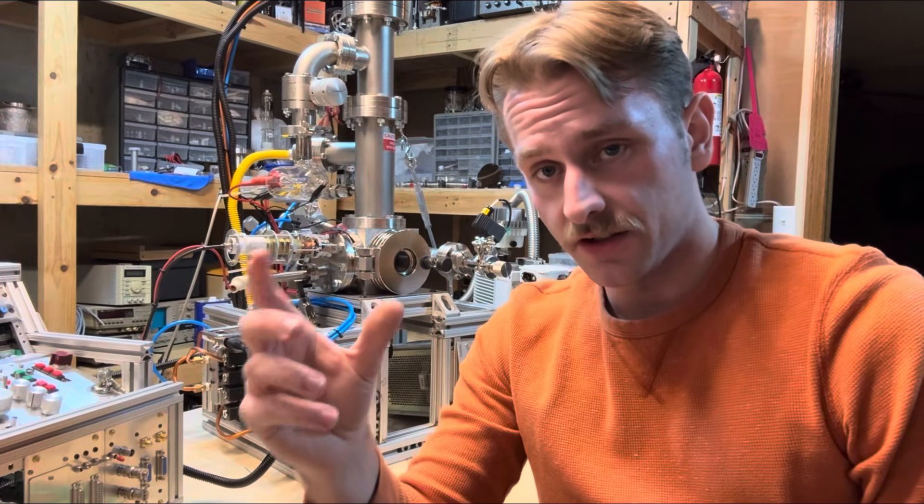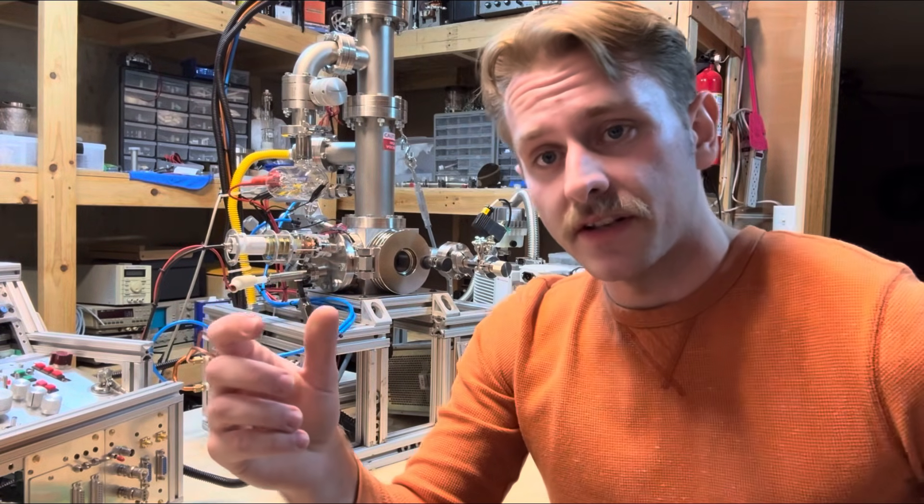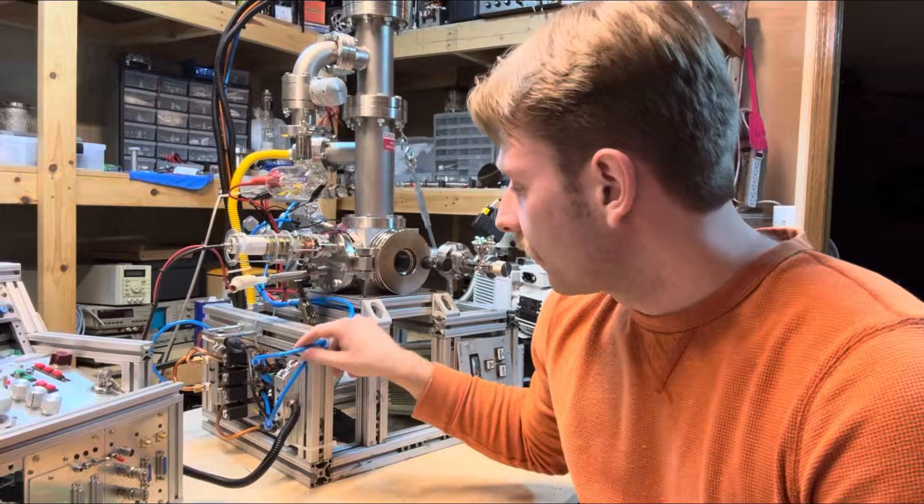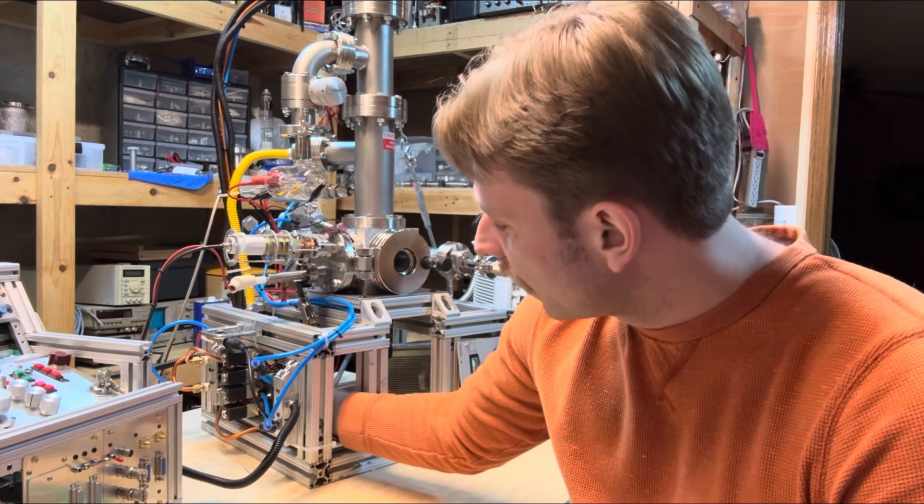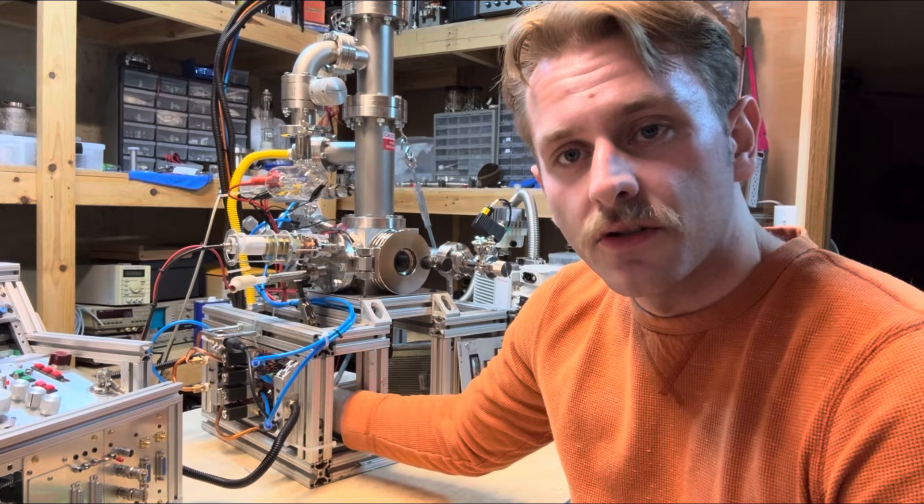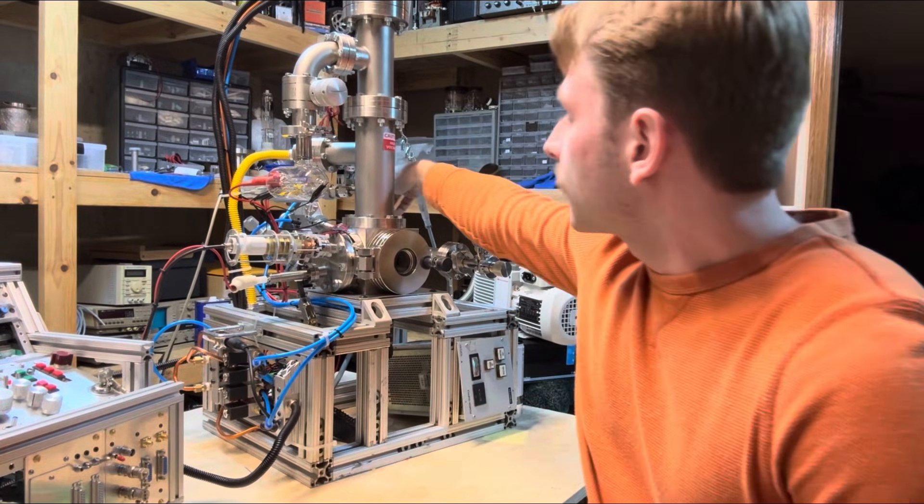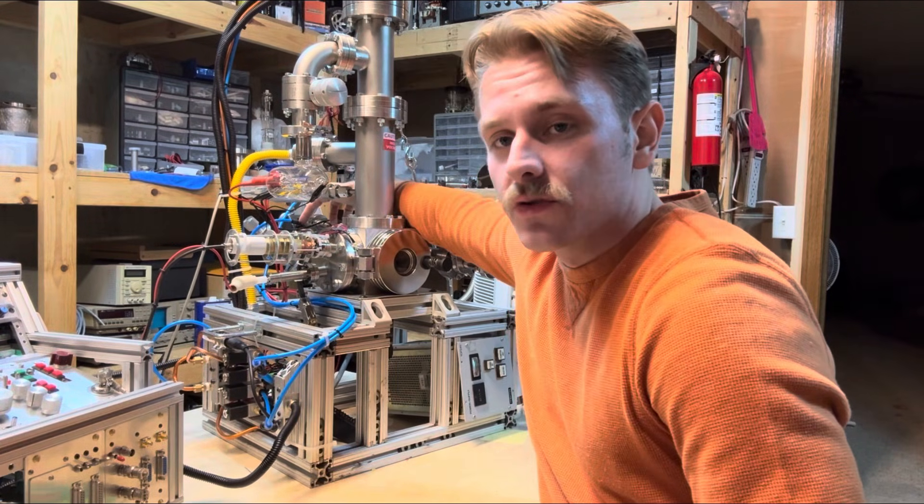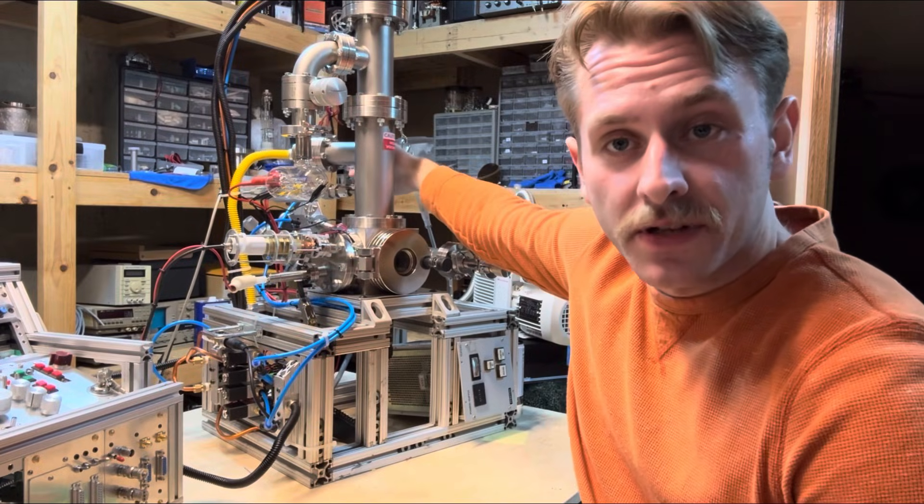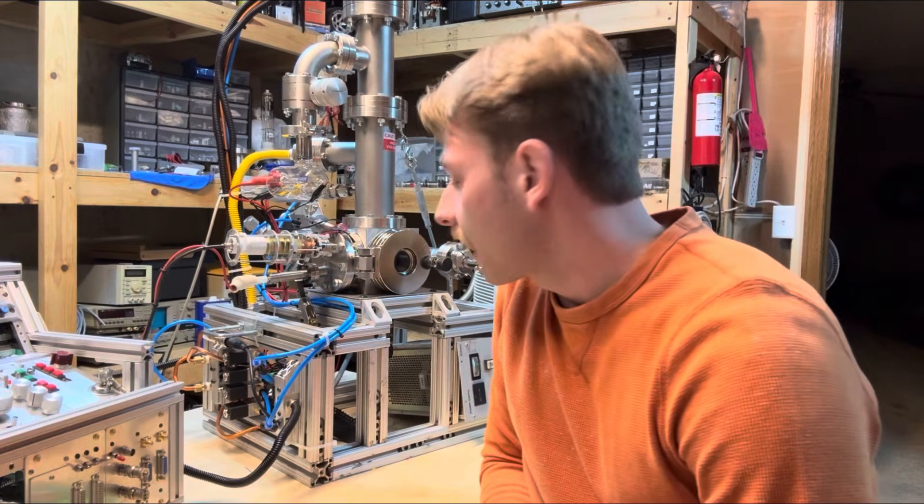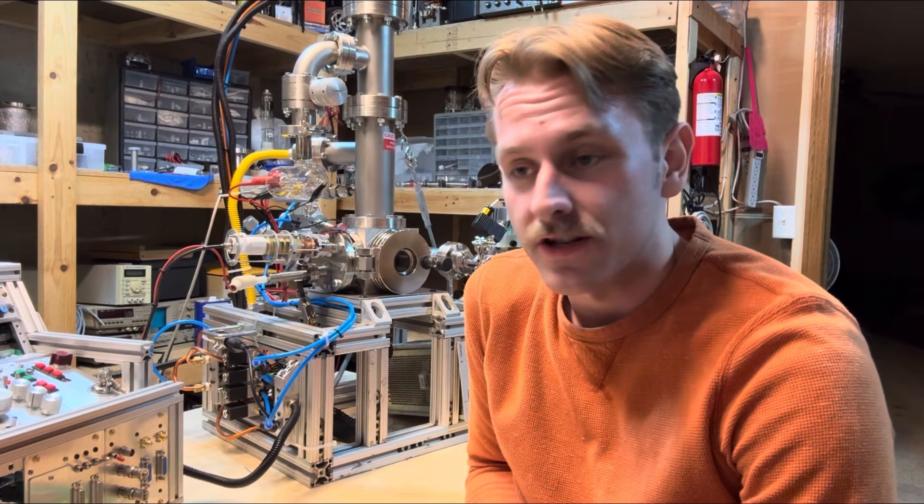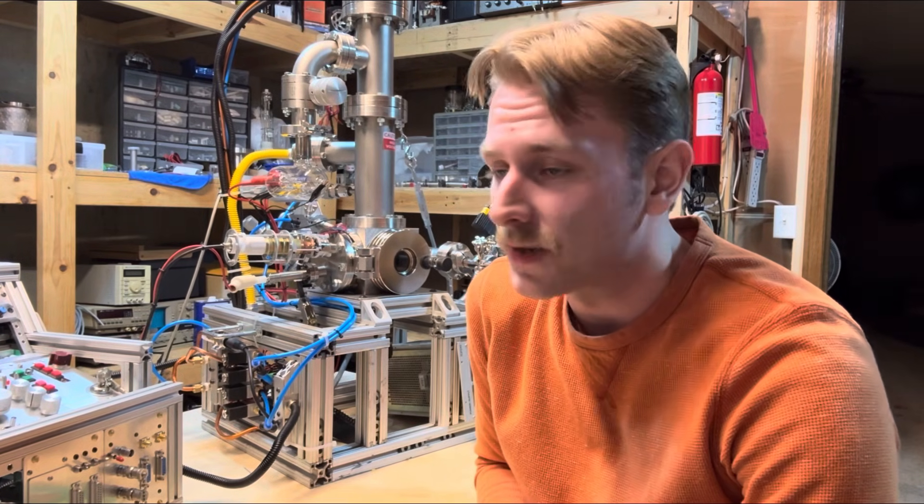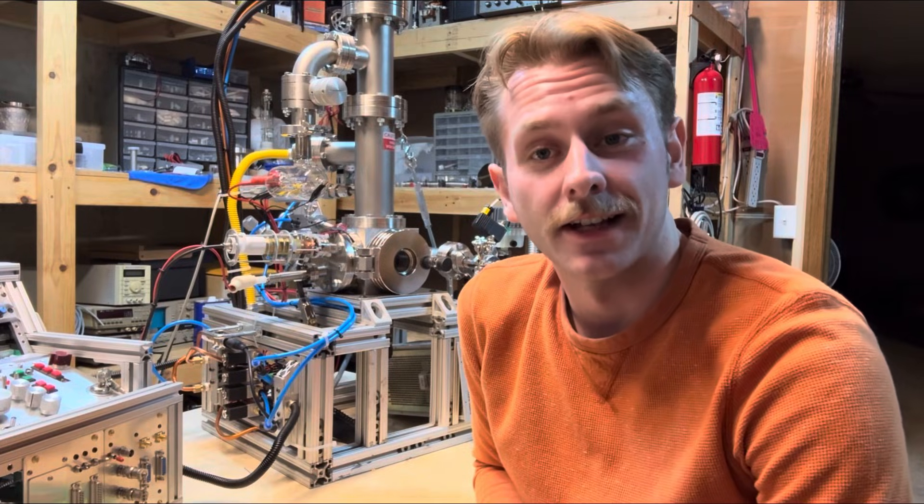Another thing about this microscope is you have to isolate the turbo molecular pump from the roughing pump. And so how I did that is with these. This is a pneumatic controller. So these have some solenoid valves that get connected to an air compressor. And then there's actually these pneumatic vacuum valves, which are in the back. I got them like $20 a piece on eBay. That is isolating those pumps. And you need to do that because, like I said earlier, that turbo pump spins at 90,000 RPM. It'll just burn up. You don't want that to happen.